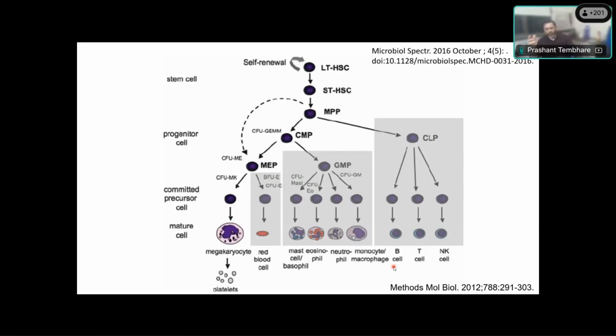So if you want to study, let's say, 1 lakh cells, you have to prepare the cell suspension in such a way that you will have at least 1 lakh viable cells after excluding debris and other junk like platelets, clumps or anything like that. That's how you have to design an assay. It depends on the sensitivity of the assay. If you want to study 1 lakh cells or 1 million cells, based on that you decide the number of events you want to acquire and study.